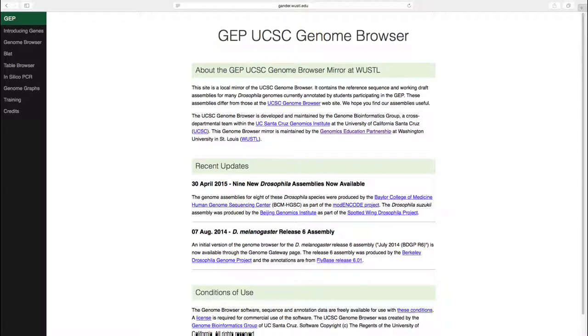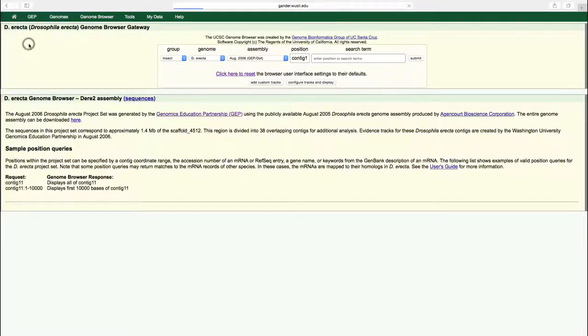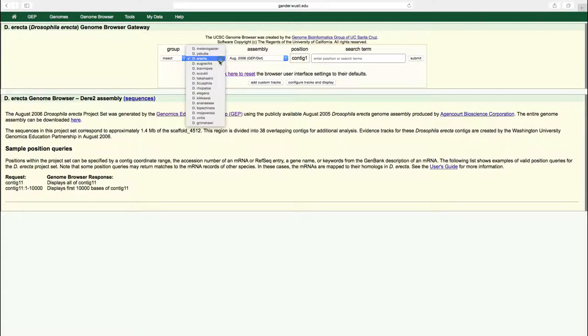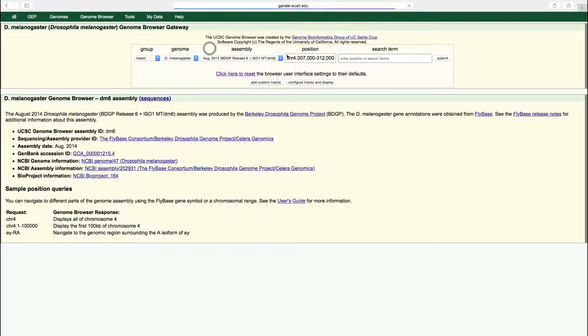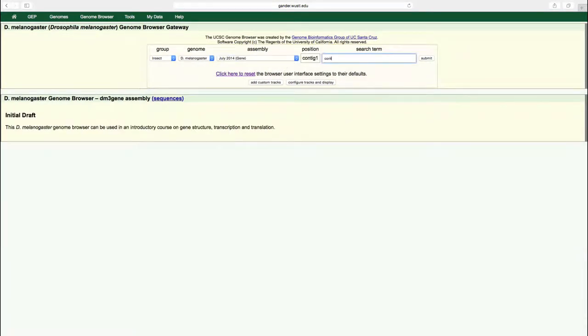We will use the genome browser to learn more about gene structure. Go to the GEP UCSC Genome Browser Gateway page and select the D. melanogaster July 2014 gene assembly. Enter contig1 into the search term box and click submit.